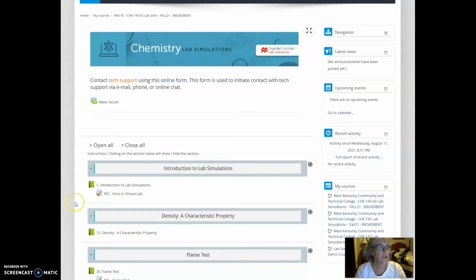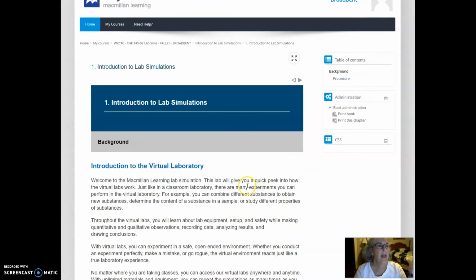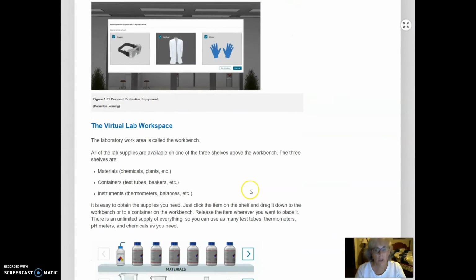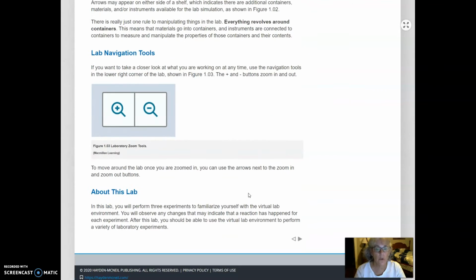So if we go into Introduction to Lab Simulations, it's right here, and each of these labs you'll have an introduction. Please do not skip the introductions. This is important information. It tells you what you're going to be doing in the lab. If I had you in person, this is the lecture I would give you before you actually get started. So it's useful information and you do need to know it. To go to the next page is this little triangle here.